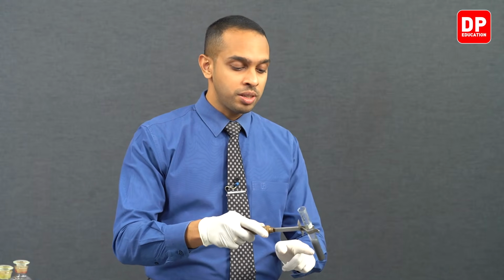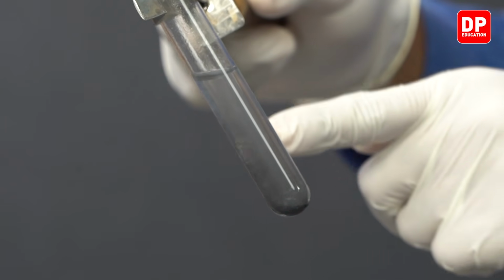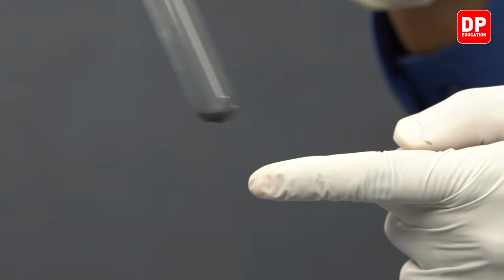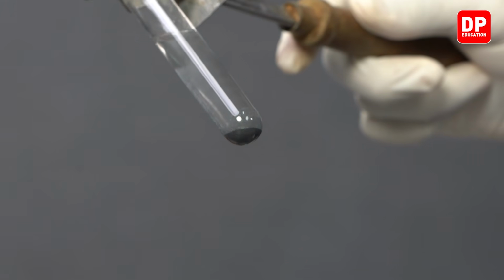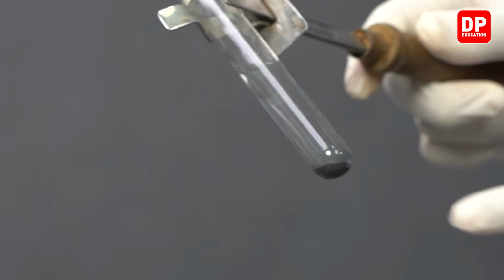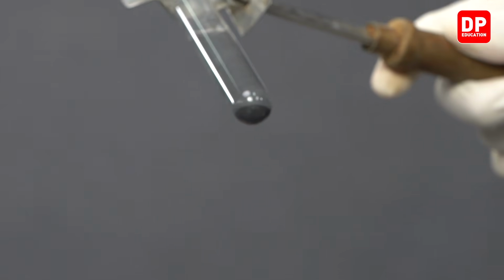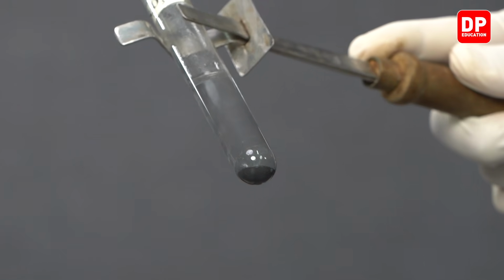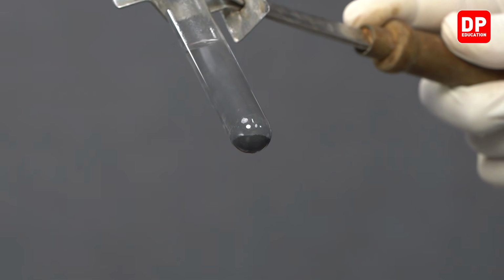Now, students, you can observe that the precipitate has turned black. We can very clearly observe the precipitate that is formed over here is getting collected at the bottom, and you can observe what we have formed over here is a black color precipitate. So this black color precipitate is lead sulfide, and this was formed by taking our lead thiosulfate precipitate and heating it.